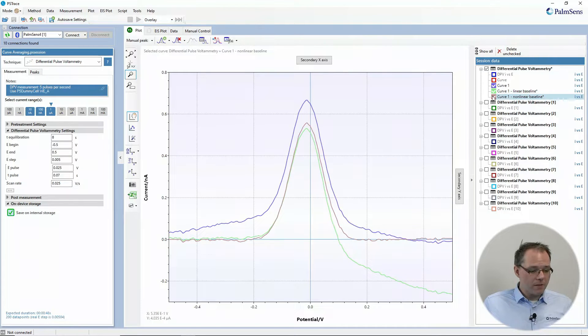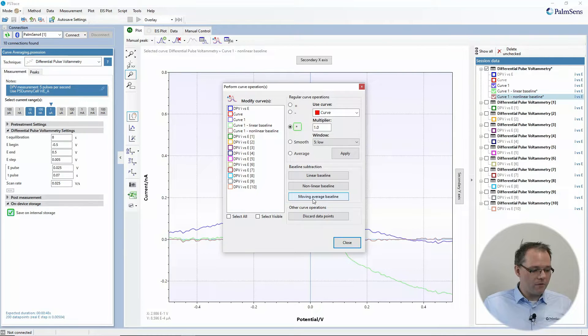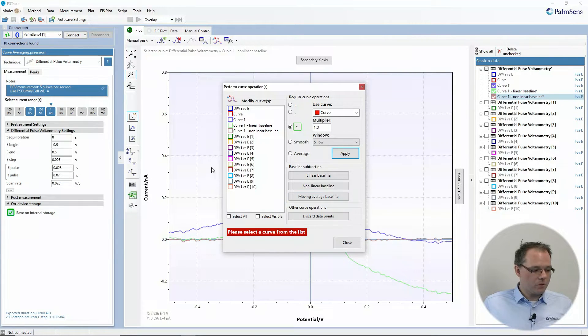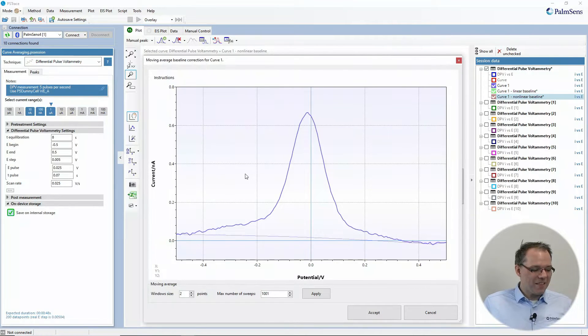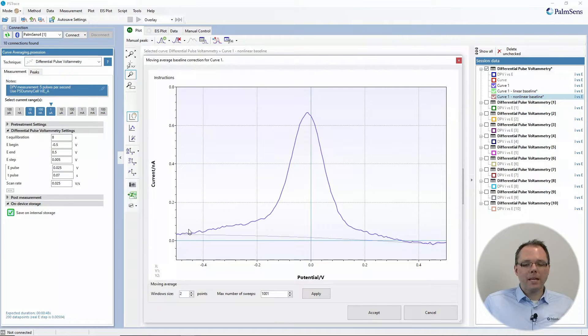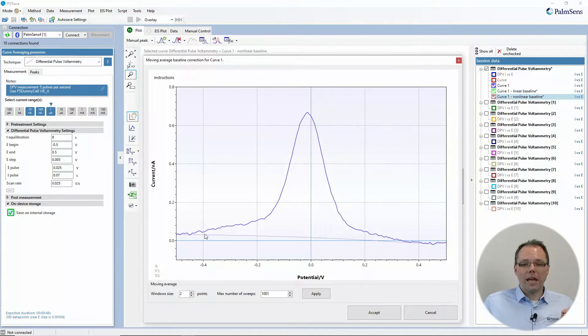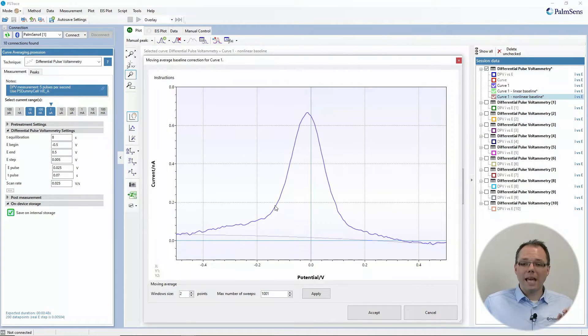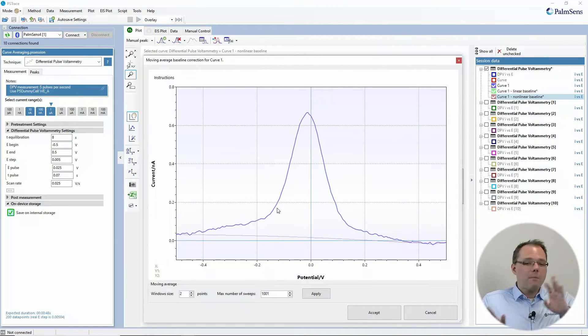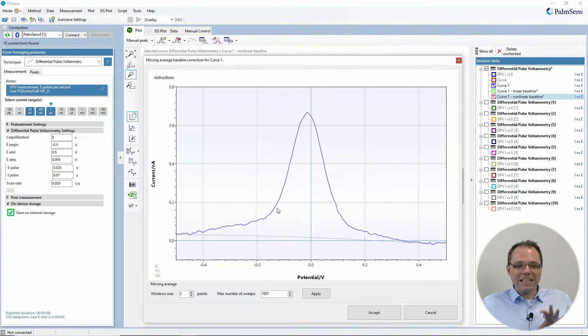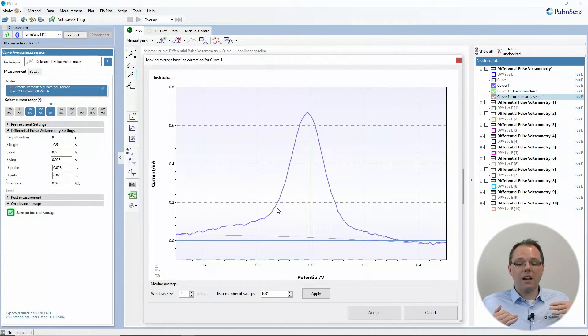And the last one that I would like to show you is the moving average baseline. Here what you do is, we basically make a baseline by averaging windows, point windows. So you can select how big that window is. You make averages, you compare the averages and then we're averaging the averages and comparing, etc. till we have completely got rid of the peaks and just are left with the line. The steeper a peak, the faster it will be dampened in that baseline.